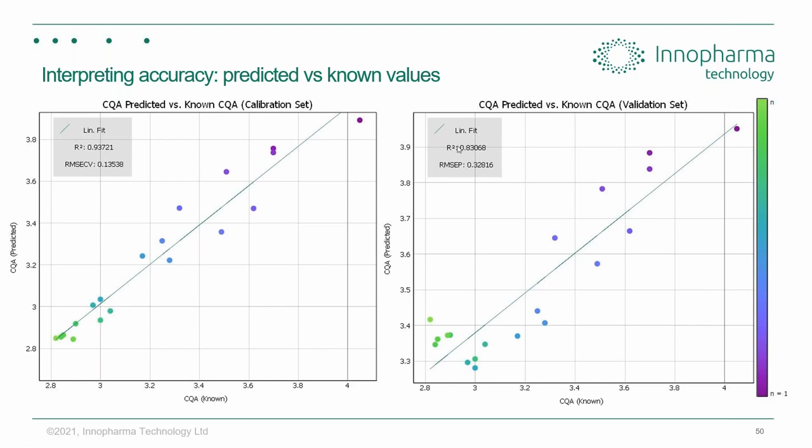Well, the analysis tries to find the ways in which your data is changing the most. And it then gives you, in order of highest priority, the components, the dimensions in which it changes the most. So for example, your first component might correspond to 80% of all of the variation in your data set. Your second component might correspond to another 15%. So within the first two components, you've already got 95% of the variance in the data being explained. Okay, I realize this is at a very high and abstract level. We'll provide you with concrete examples when we look at some of the data in a moment.